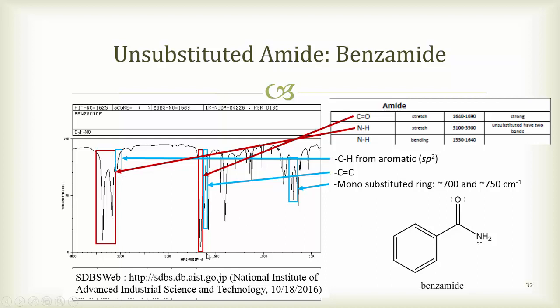And again, I'm looking at 1600 as my point of interest here, but you see it right there. And then I'm not really seeing the 4 fingers in this case, but that doesn't mean it's not aromatic just because I'm not seeing it. I'm looking for the fact that this is monosubstituted in that 700 to 800 region, and we do see 2 peaks in this region around 700 and 750. Again, the intensity isn't as great as some of the others. It's a little harder to pick out in this particular example that you're dealing with an aromatic ring. It's in fact quite a bit more difficult.